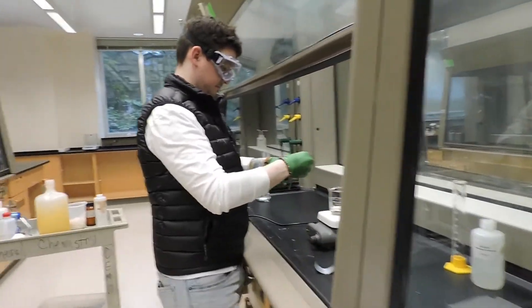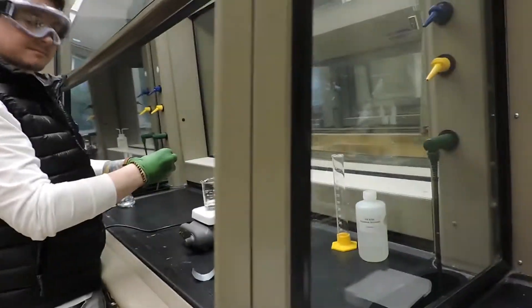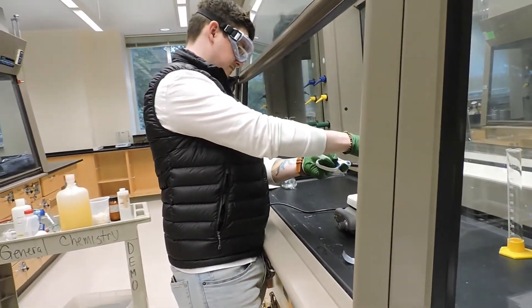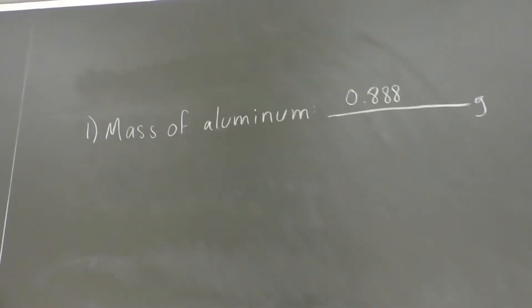Today we're going to do the preparation of alum with Jared. So first he has weighed out some aluminum and that mass is 0.888 grams.